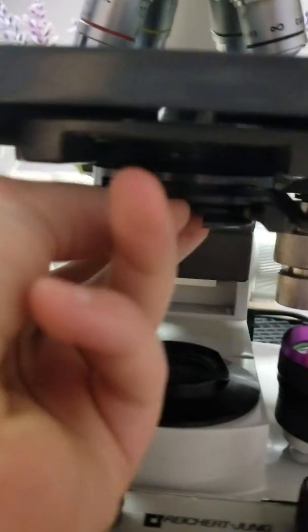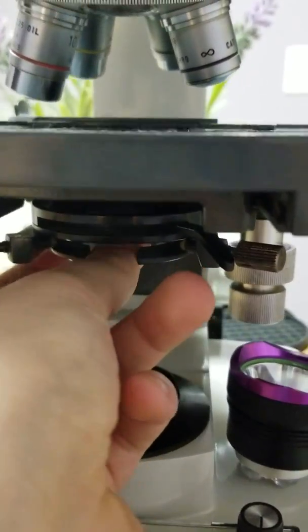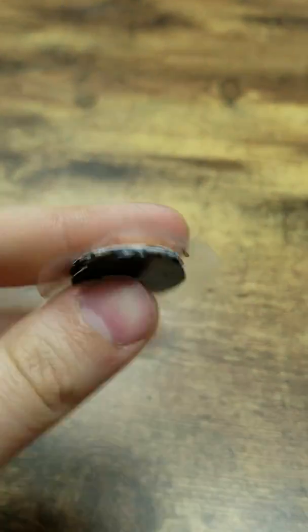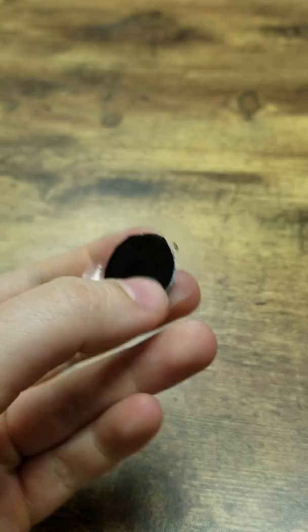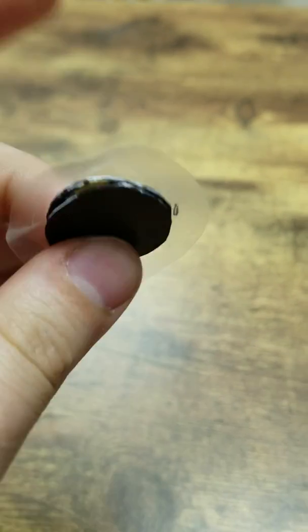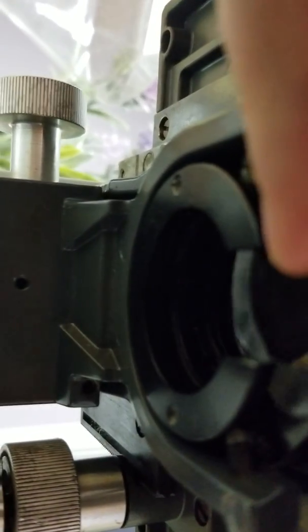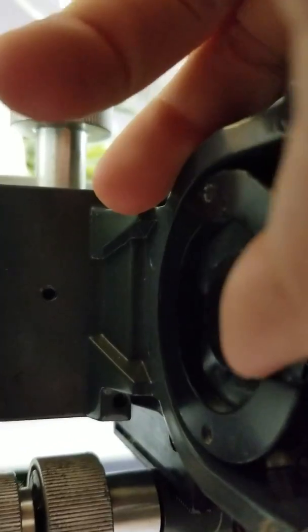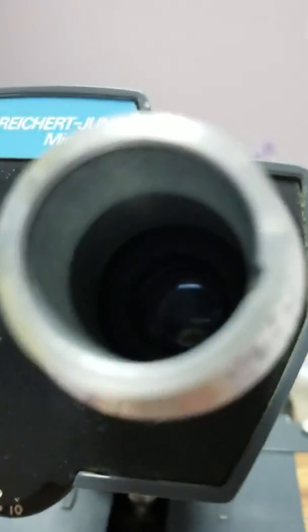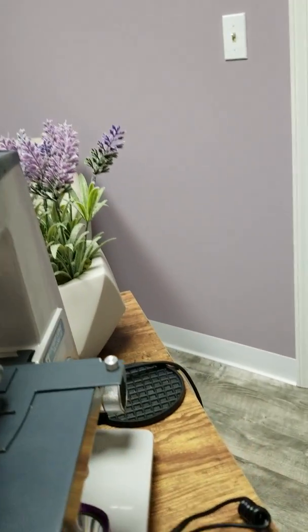And then to change it to dark-field, I have a little homemade stop. So it's just business cards cut up into the little circular stop. I have like three layers there. And then just place it in the, slide it right in the condenser there, and it's in. So then you just take the eyepiece out, look into it, and here I'll actually show you.